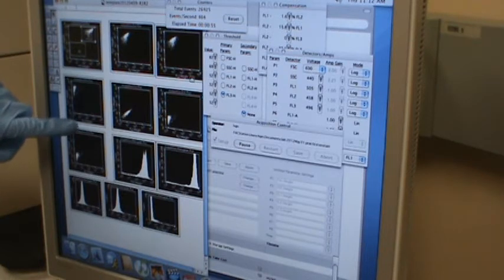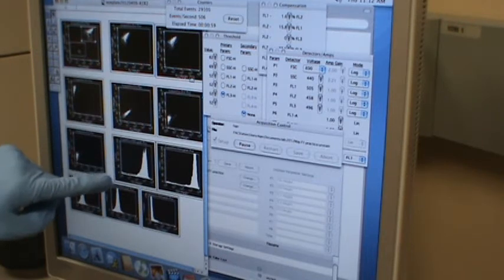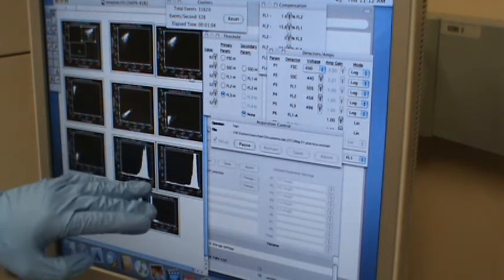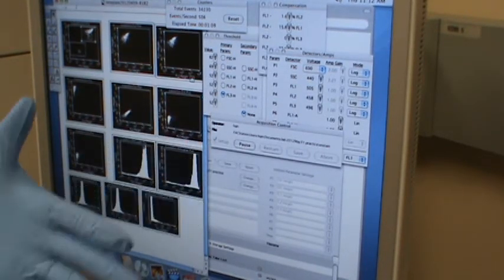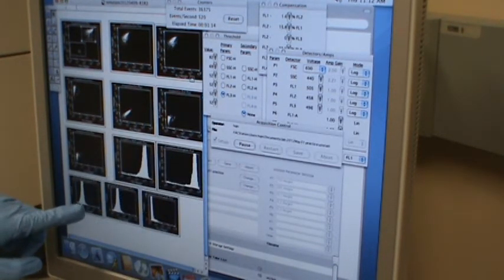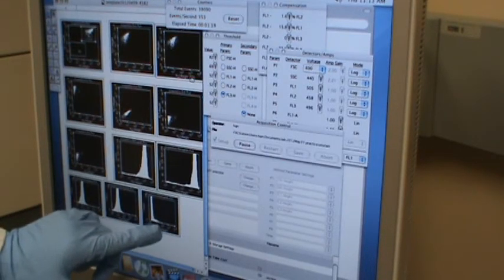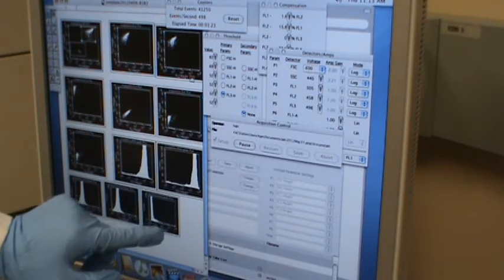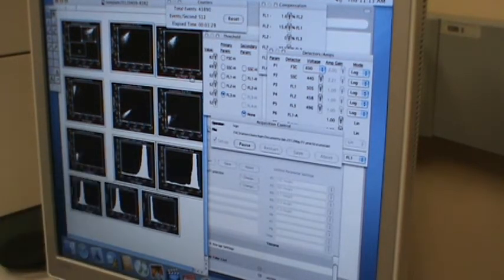That's channel 3. So that's the two-dimensional part. This is called a histogram. That's the FSC. Most of the cells are very large, so it's good. SSC, most of the cells have a kind of pretty rough surface too. Green channel, red channel, long red channel. It looks like there's some cutoff, but it's good because at the baseline, you see there's nothing exceeded 10, so we know the voltage seems to be appropriate.